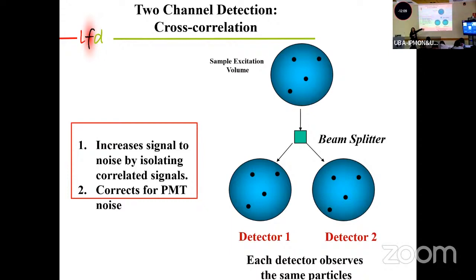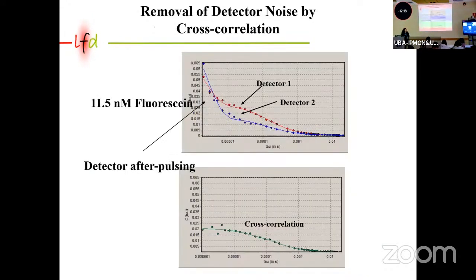We need to do cross correlation in order to figure out if the fluctuations are coincident with one another. And if they're bound together, they will cross correlate. So we can also do other things.